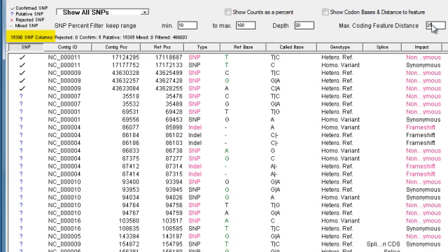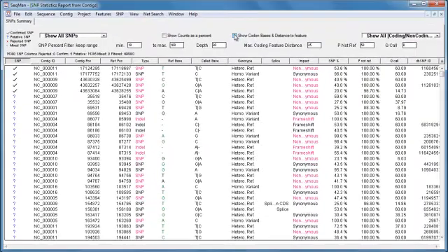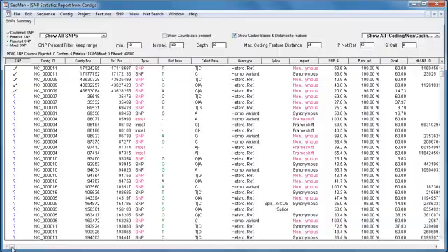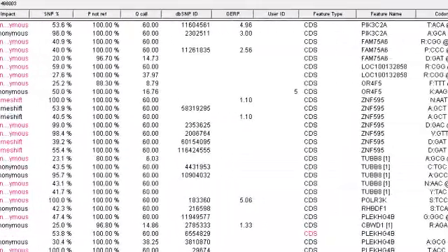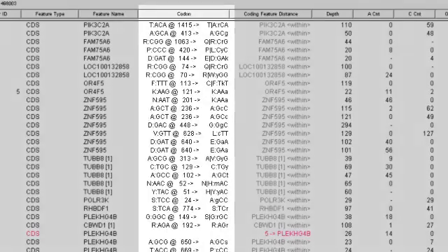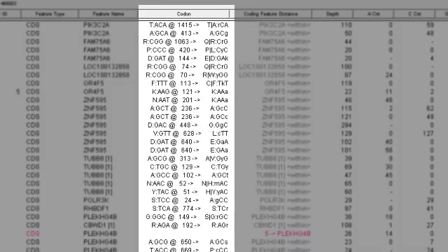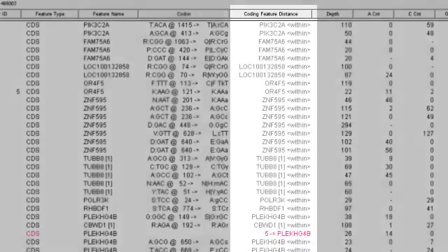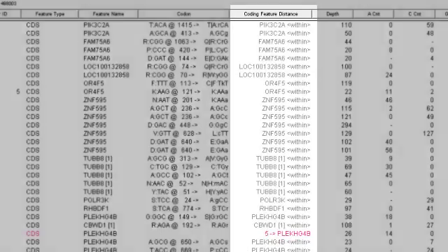If I check the box next to show codon bases and distance to feature, SeqMan will include some additional columns that show the codon change caused by the SNP and the distance to the nearest coding feature.